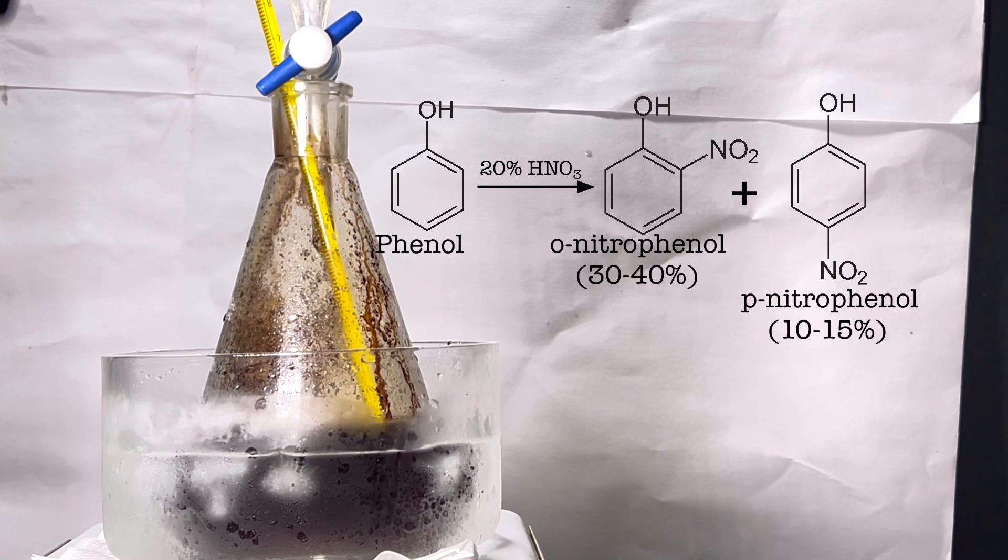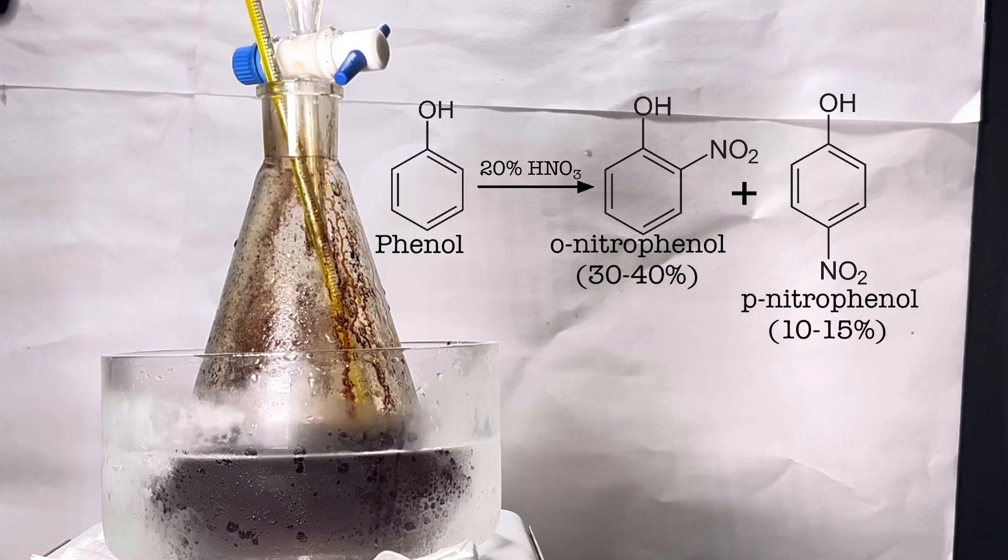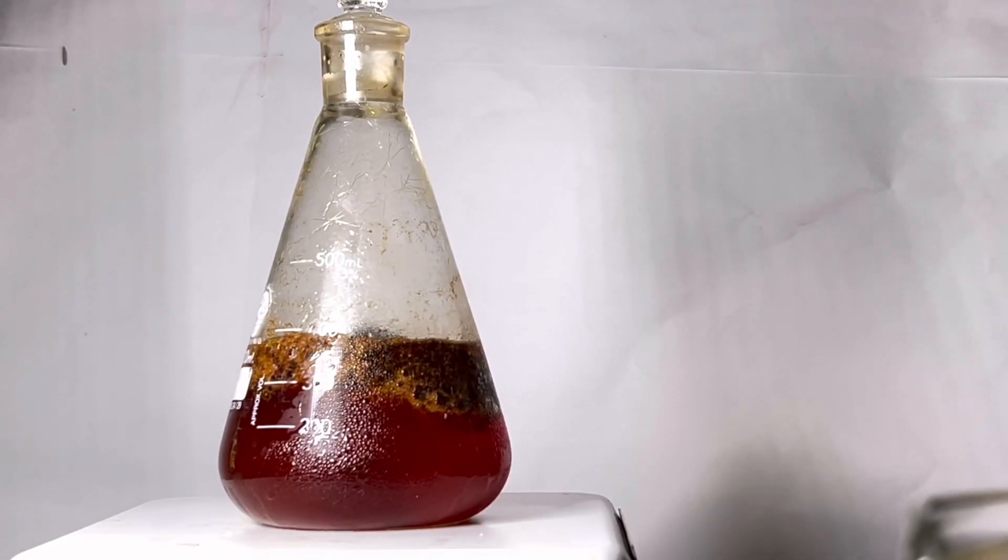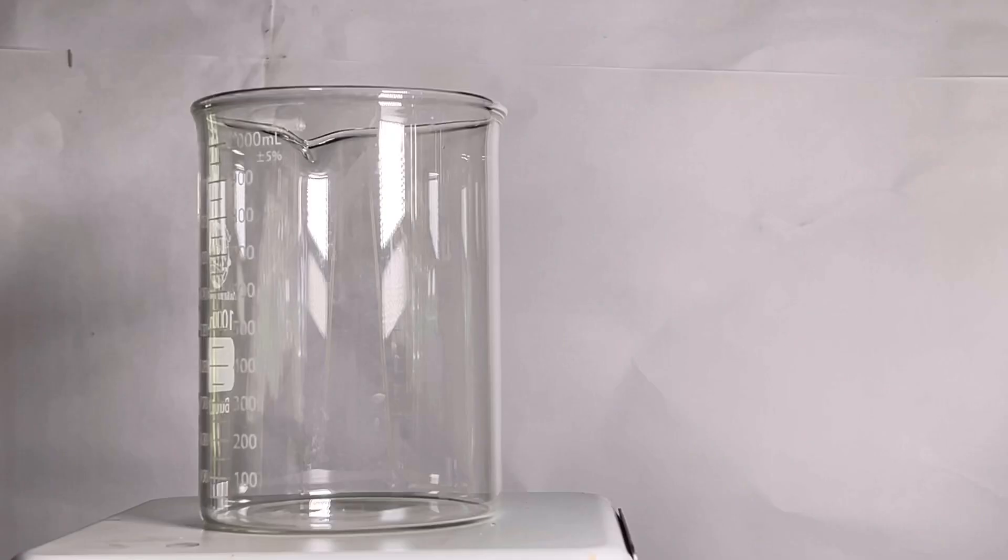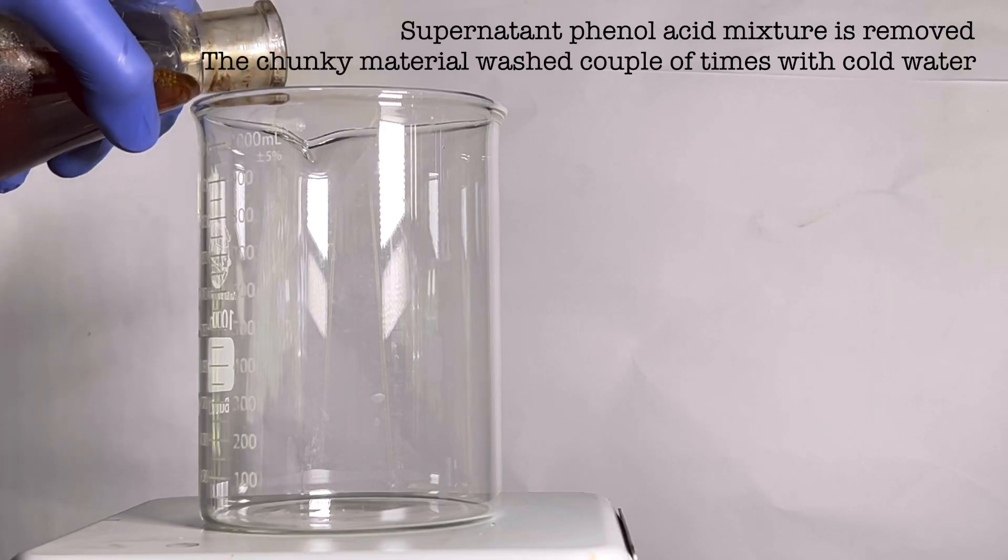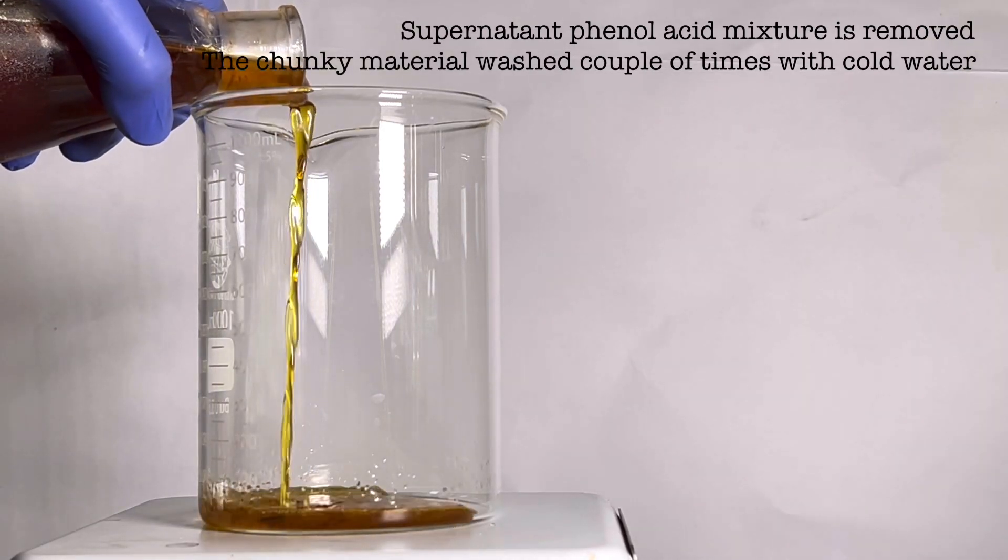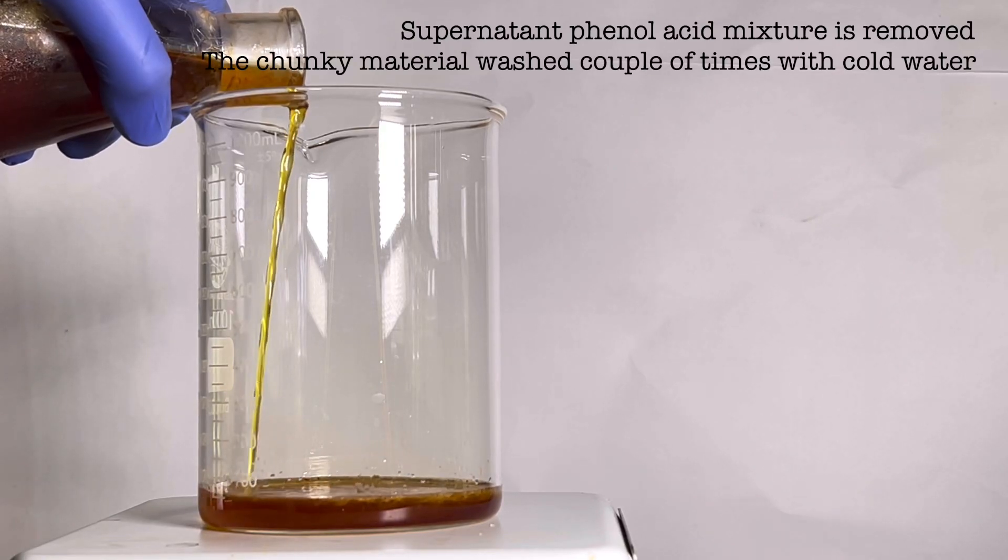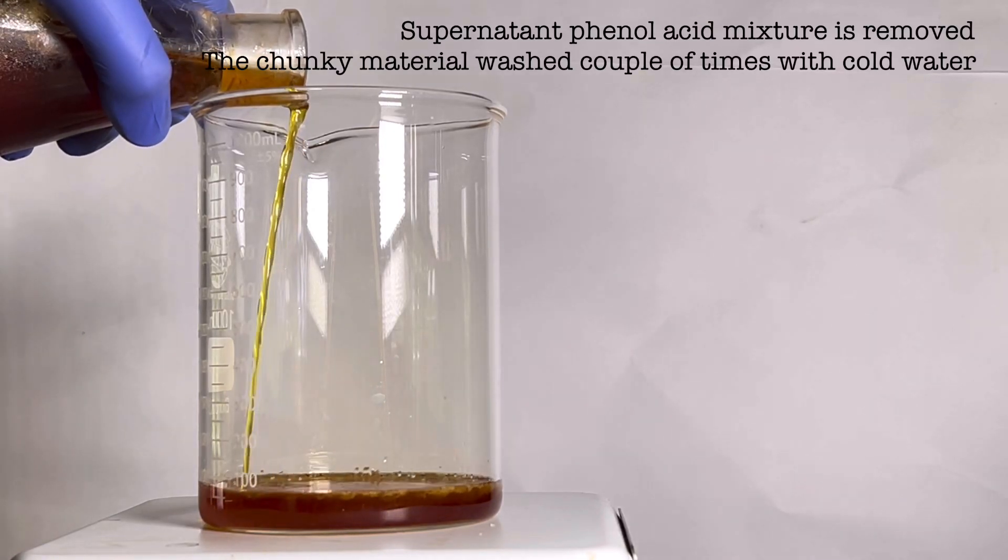After all the phenol has been added, allow the mixture to stand for one hour with continuous stirring. After one hour we have this deep red colored solution with black colored chunky tar-like material. The mother liquor is drained into a separate beaker. It contains all the unreacted phenol and acid. This mixture is extremely hazardous to health and should be properly disposed.